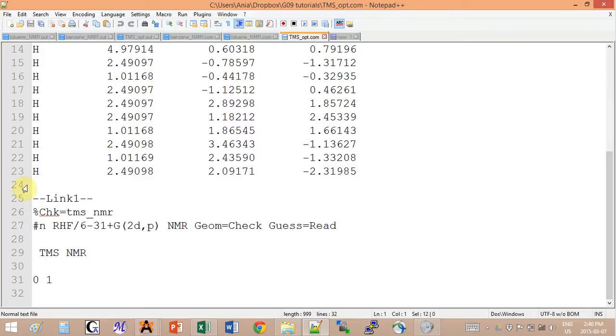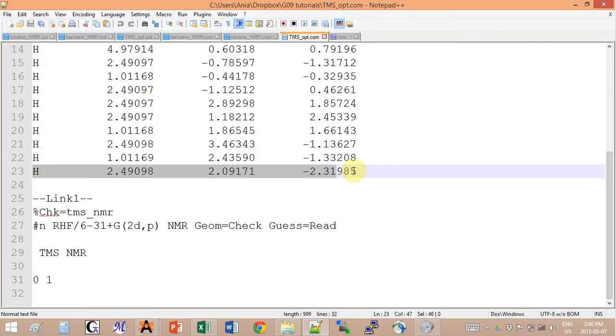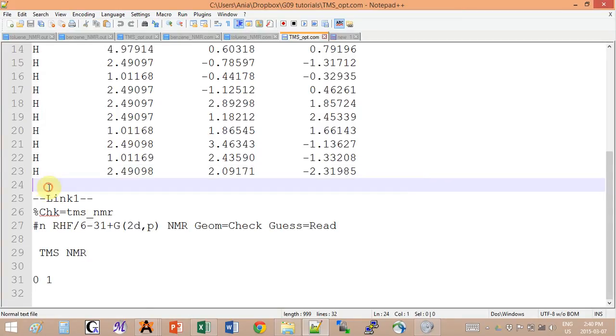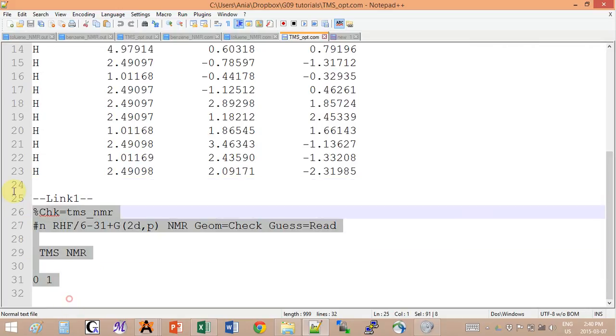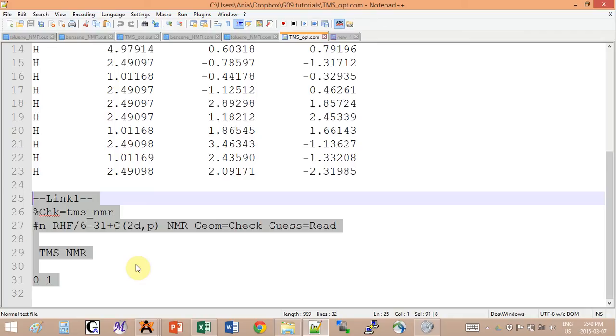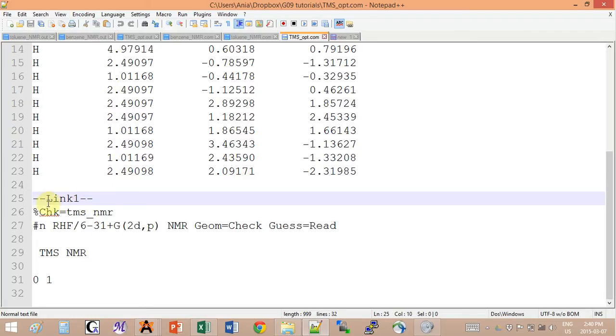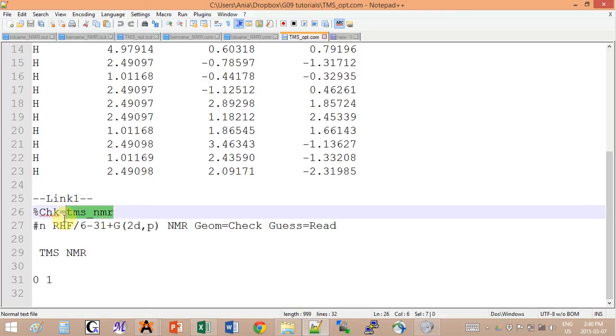Basically you scroll down after the last line of your atoms and Cartesian coordinates. After you skipped one line, we will have to add this whole second part over here that will tell Gaussian that the work is not done yet and that we have to also compute NMR shifts. This link one line indicates to Gaussian that it's not over.